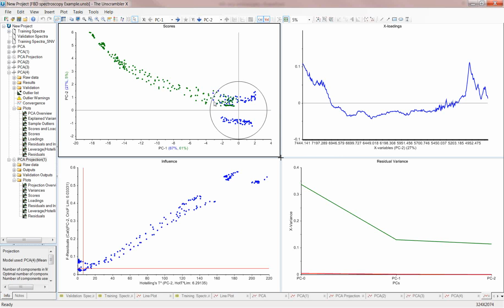So you can use this to drive your process understanding of what's going on and how to choose an endpoint in a qualitative manner rather than waiting for, say, limit of drying, which may take 15-20 minutes. And all that whole time that you're waiting for things to be dry, they might get over dry, you can have granules falling apart. So this helps you get some real-time analysis as it's happening.